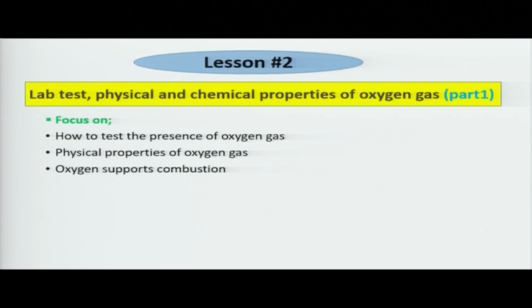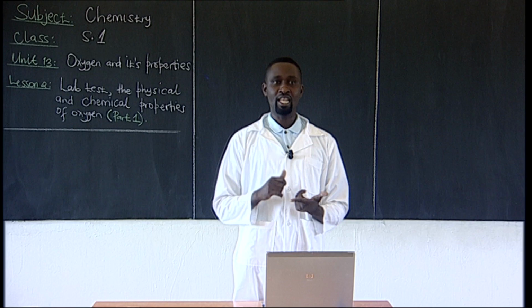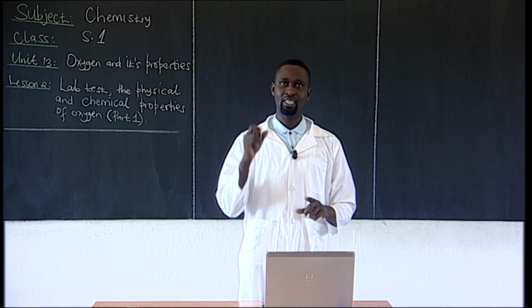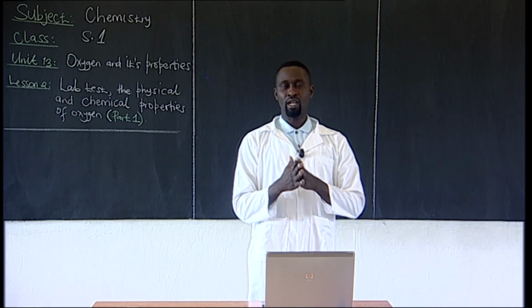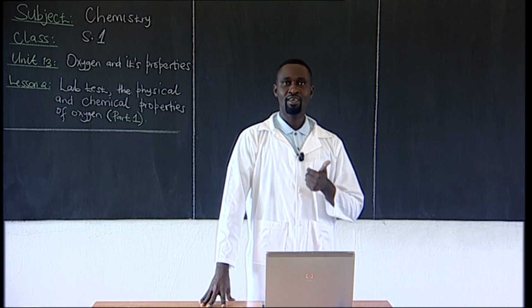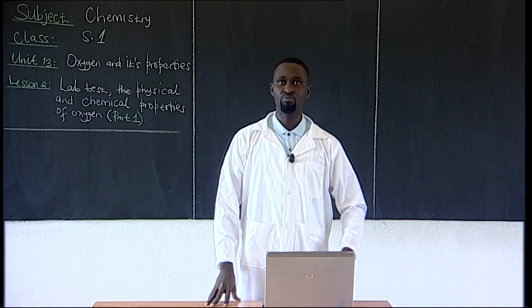So I always like to highlight what will be making up the lesson together with the key terms. So in today's lesson, as I said, we are going to demonstrate and observe the real test for oxygen. Exactly how would you tell that this gas is oxygen? That's what we are going to do. We are going to do it as we see what are the different observations. Then we shall go through theoretically the experiment to demonstrate that oxygen supports burning. Many of you have always said that in your primary, so we are going to make a quick demonstration on that.